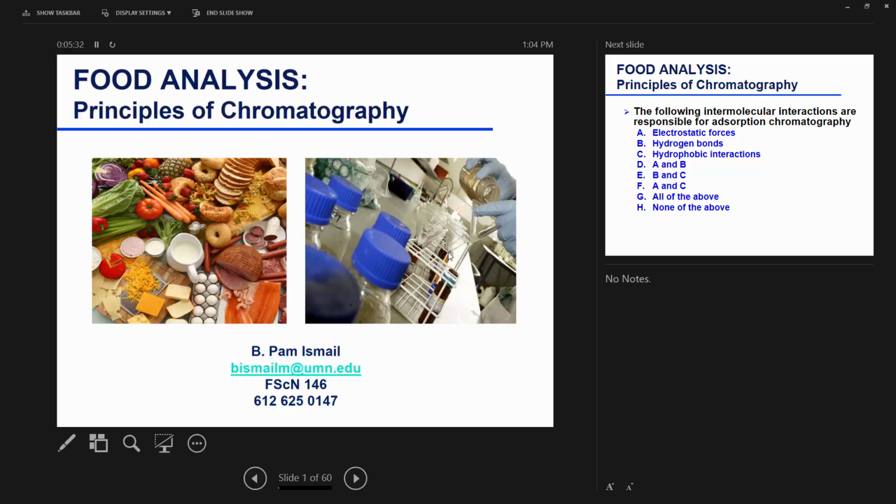However, she takes her time, interacts with stuff. The only way I can get her out is buy her something. So that's the mobile phase, where in order for something to leave the column, you have to give something in the mobile phase to have that solute come out. So basically, this is how it goes. So that's chromatography. You have the stationary phase where your solute or whatever is in your sample is interacting with the stationary phase. And then the mobile phase is carrying you through, but in order to come out, you have to give something in the mobile phase to help come out.